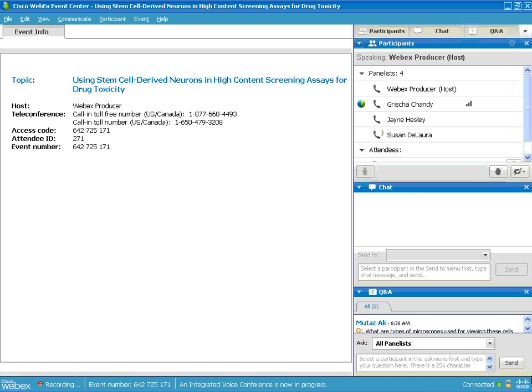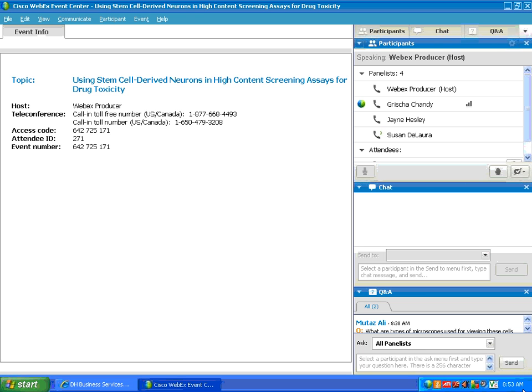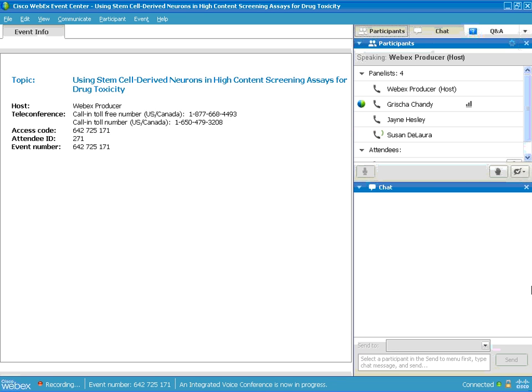Another question that I had was what serotype of the AAV was used. We specifically used in-house here ourselves the AAV1. I know that some outside users, some people that are using our cells, have also used a mix of 1 and 2, and it has been successful with that.